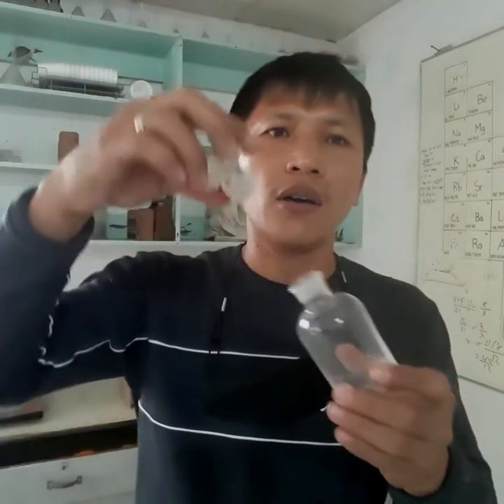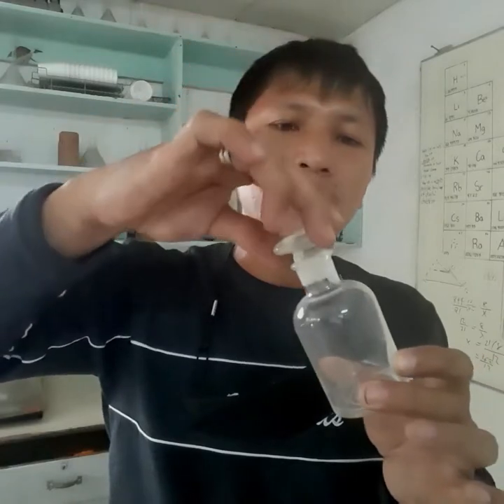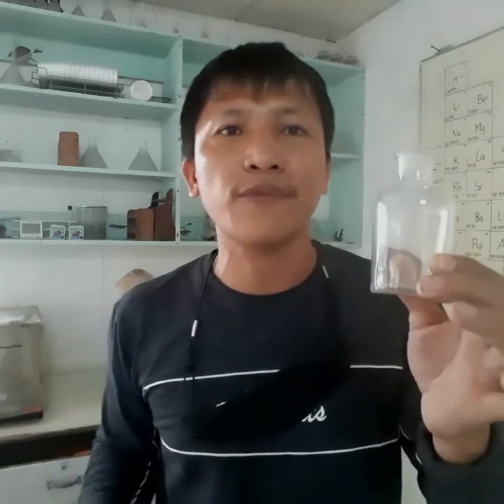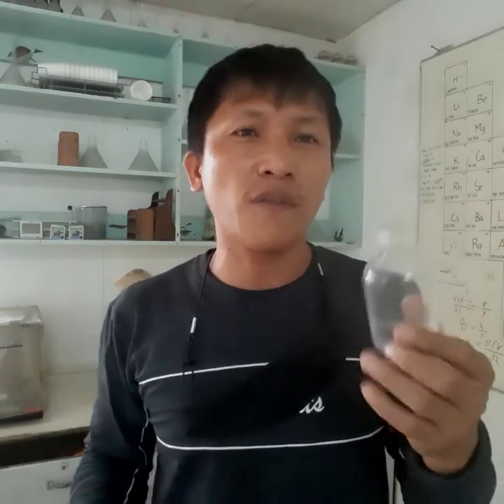Next, we have reagent bottles. Reagent bottles have glass stoppers or covers. So when you mix reagents and the sample requires you to mix the substance to come up with a particular concentration percent or volume percent, those mixed compounds are already called reagents. You put them inside reagent bottles for later use or later observations. That is the use of your reagent bottles.